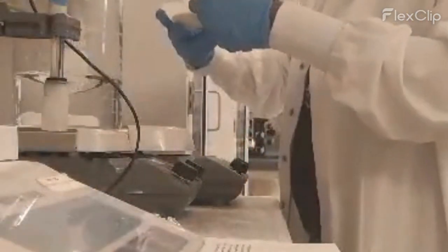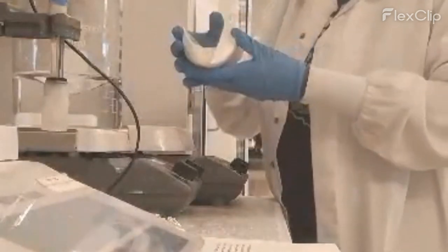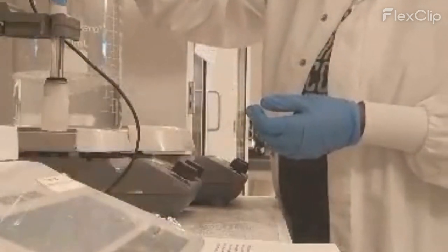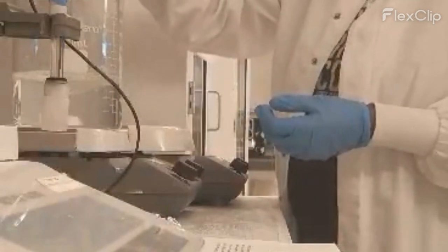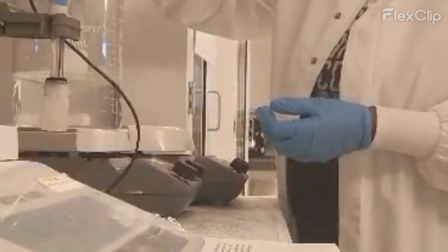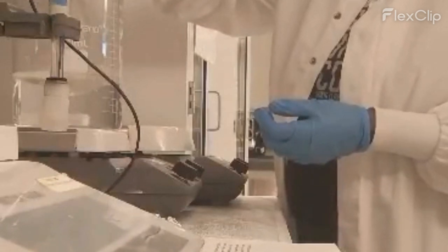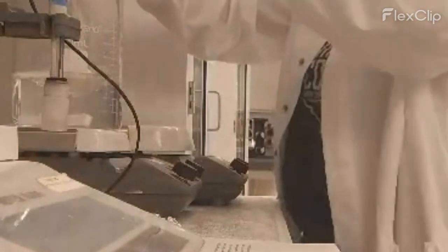It's time to mix my reagents, which is why I'm putting on gloves first, because I didn't want anything to get on my hands. This is where the magic happens. I'm carefully following the protocol, ensuring accuracy is paramount, as I said before. Now the stuff that I'm mixing really stunk, like rabbit pee.